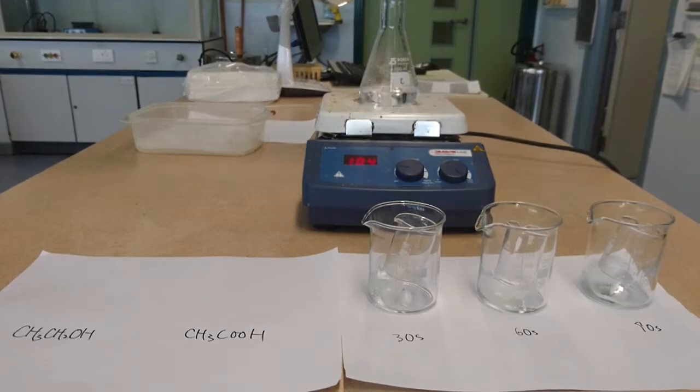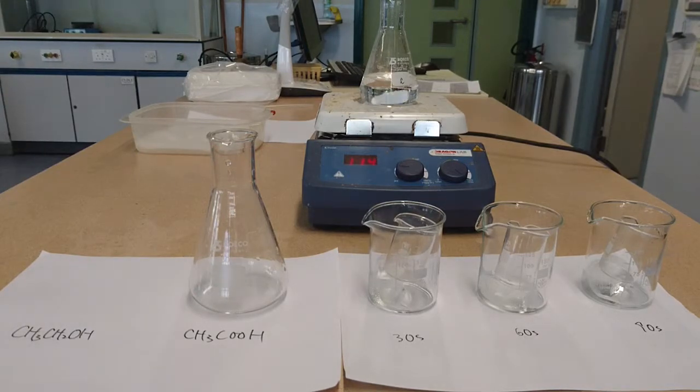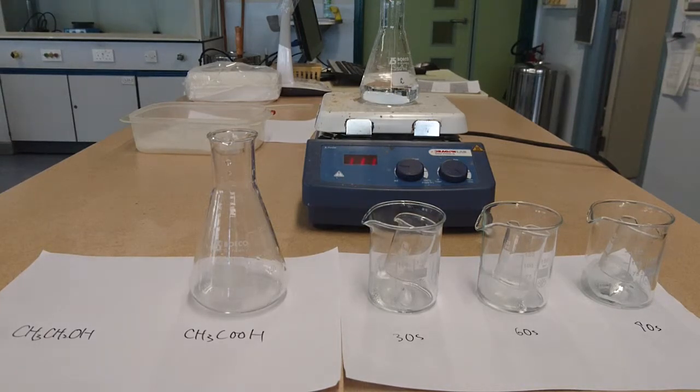I add the acid inside, and it continues to react. After 30 seconds, so it's now 1 minute 10 seconds, that is the time we can take a rest. What we mean by take a rest is that you can see this is now reacting, and we're waiting, and the concentration of both the alcohol and the acid will decrease, and the product ethyl ethanoate will increase. However, the rate is slow so that we can monitor it in this way.